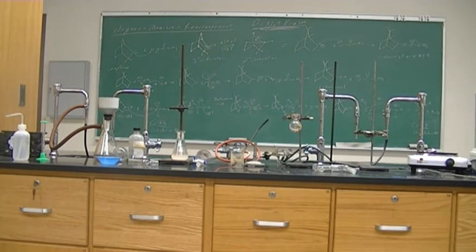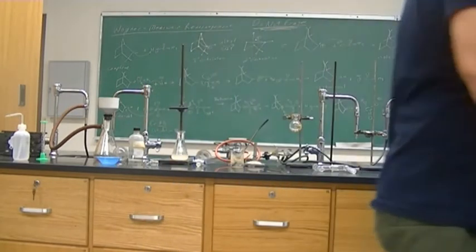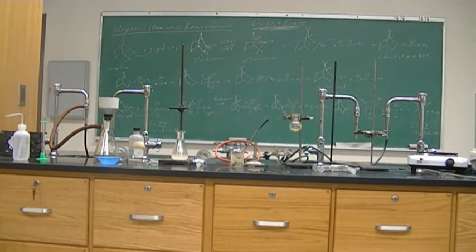So we put in our 1.7, let's see if we can subtract it. 38.7585 minus 37.0682. We'll just go with 1.69 grams. Three sig figs, all we need, 1.69 grams. And to our 1.69 grams, we're gonna add 3 mL of acetone. And then we're gonna add 3 mL of chromic acid.